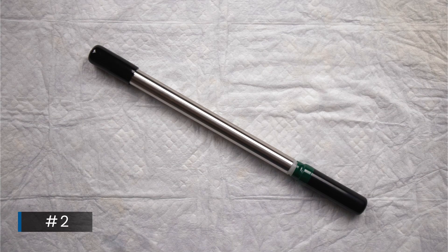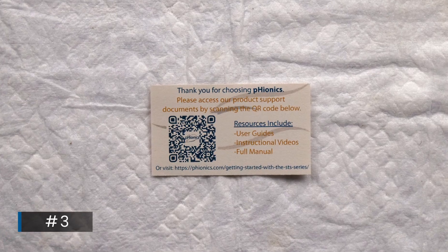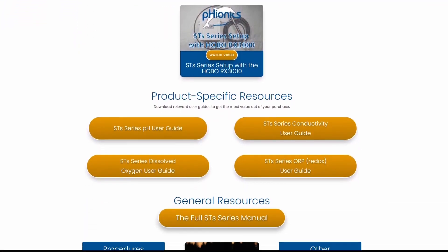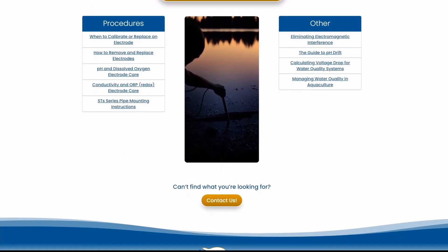Number two is the sensor body with a protective boot on either end. And number three is a card with a QR code you can scan with your phone to take you to our resources page containing the manual along with other instructional videos and articles. The website address is on the card as well if you don't have a phone or app to scan the QR code.